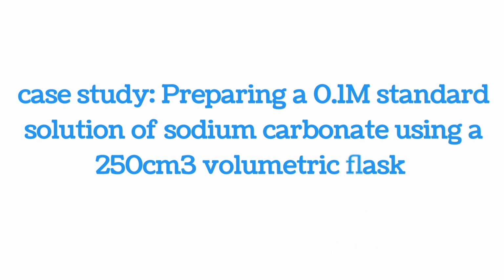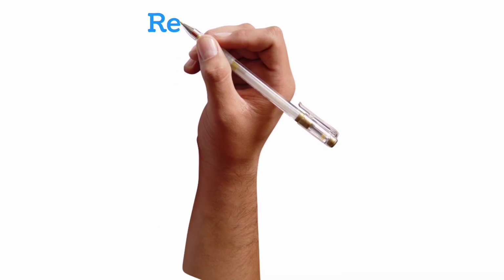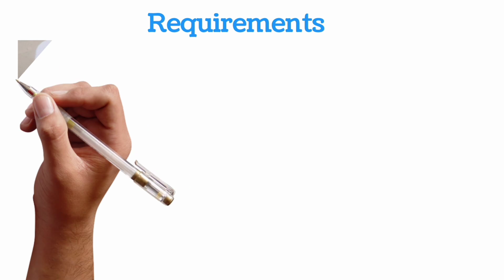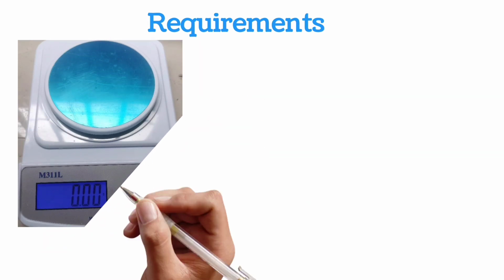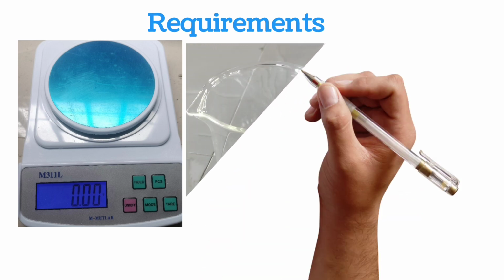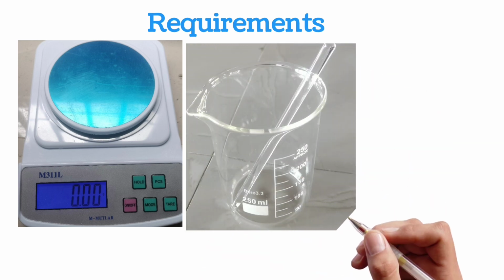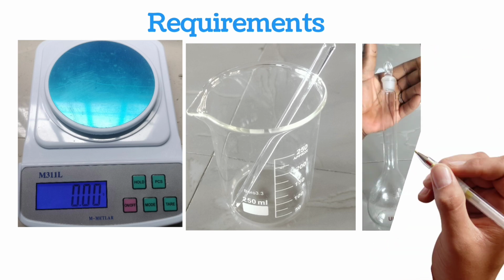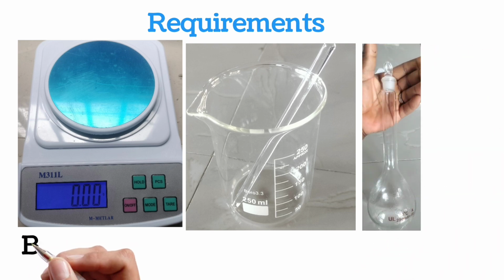We have a case study on the board. Preparing a 0.1 molar standard solution of sodium carbonate using a 250 cm³ volumetric flask. Let's start gathering the equipment we'll be needing in preparing our standard solution. As I draw, you should be naming those equipment. That's the first one, the second now, the third one. I'm going to draw just the essential and just name the others.